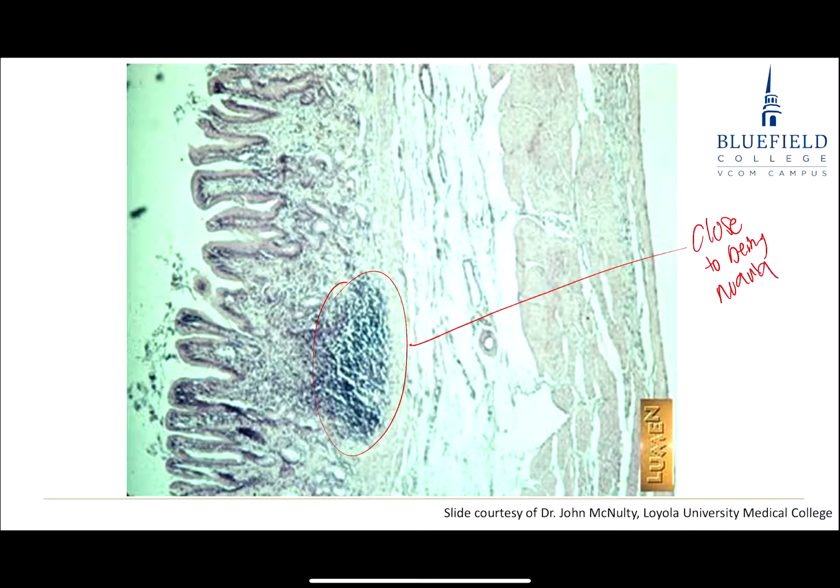Okay. And that's the whole thing that I want you to realize. If diffuse isn't enough to fight out that infection, it will become nodular. And if nodular is enough, it'll be a nodule with a germinal center. But it can stop anywhere along that continuum if I fight out the infection, get rid of much of my clonal army, and diffuse the remaining cells.